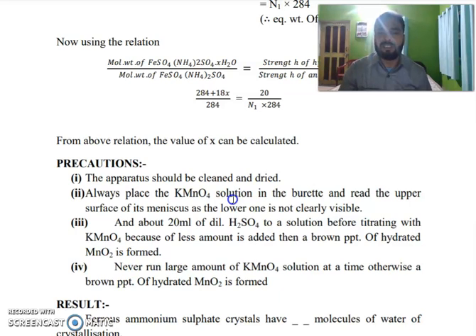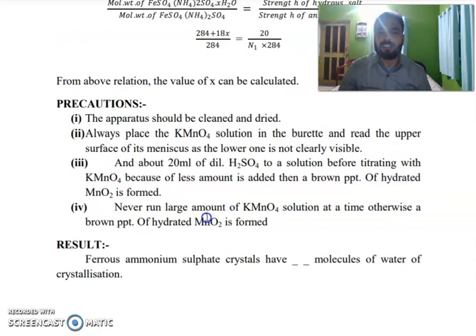And then you have to write the results. Ferrous ammonium sulfate crystal has molecules of water of crystallization. So whatever the number of water molecules of crystallization, you have to write here.